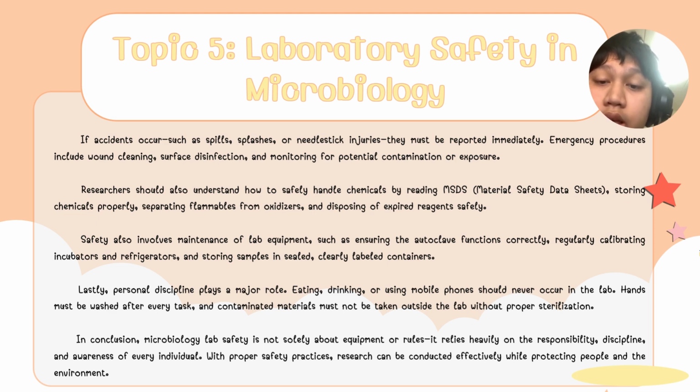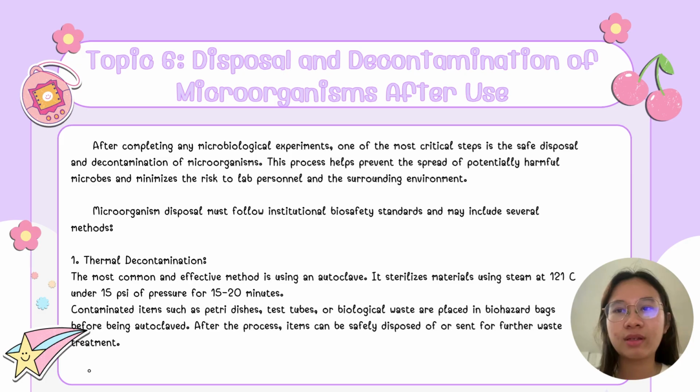It relies heavily on the responsibility, discipline, and awareness of individuals. With proper safety practice, research can be conducted effectively while protecting people and the environment. Let's move on to the last main point, which is disposal and decontamination of microorganisms after use.